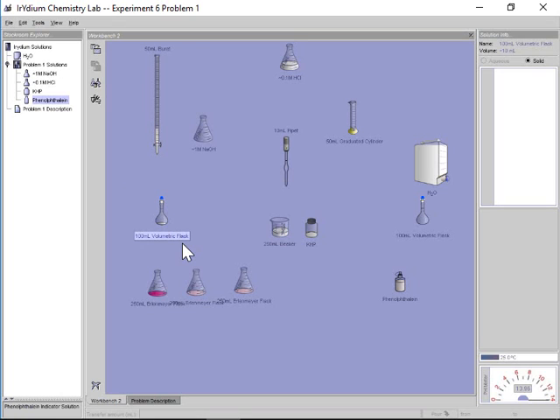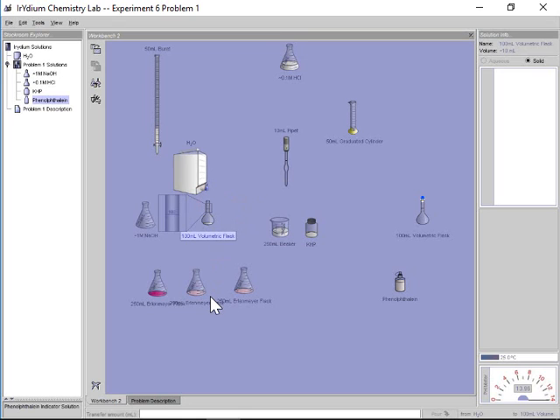And what I'm going to do is add it up with some water. Again, you probably wouldn't take the entire flask of the water to actually dilute this completely. You'll probably pour this into either a graduated cylinder or beaker of some sort before you transfer it in. In this case, I'm just going to be a little lazy. I'm going to drag the water directly over this flask here. So I had 9 mils ready. I can pour in maybe 90, actually no, let's just go 85 mils. I can pour in 85 safely, right? 85 plus 9 definitely will be under the mark.